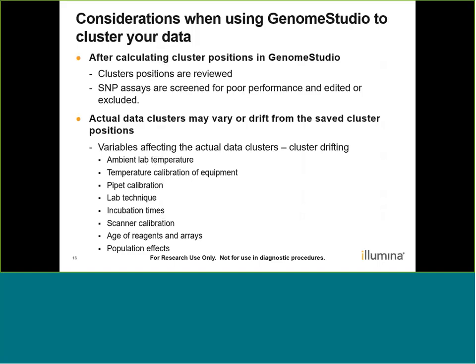And then finally, population effects. So if you're not using samples that are either the same sample type or from different populations, that will affect the clustering.